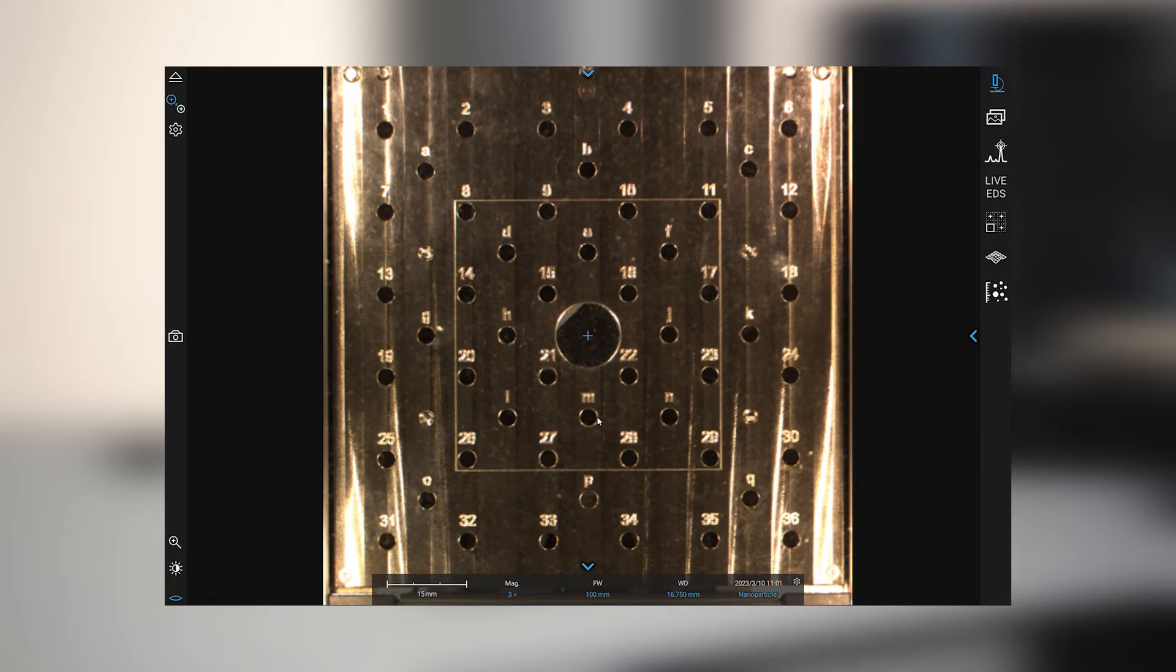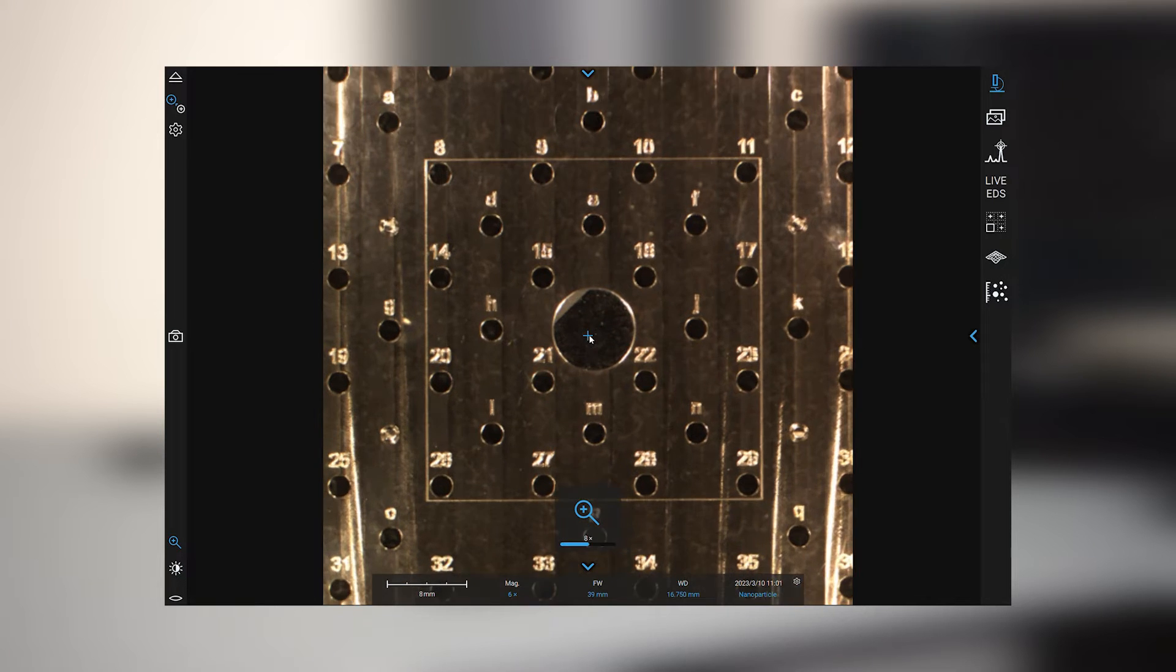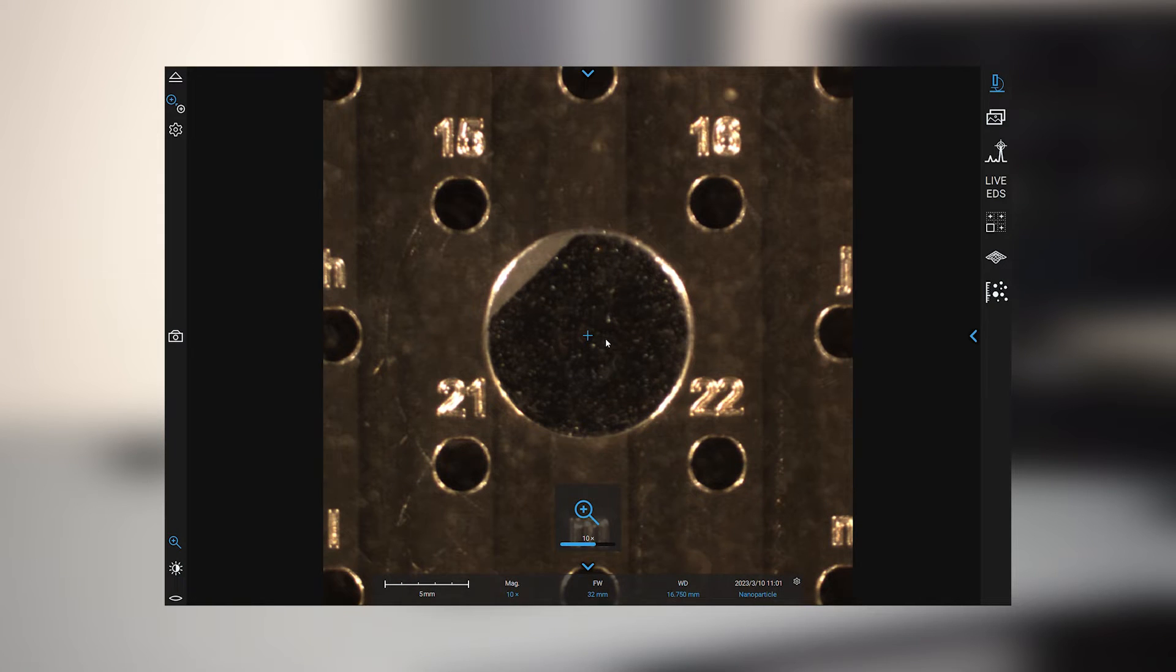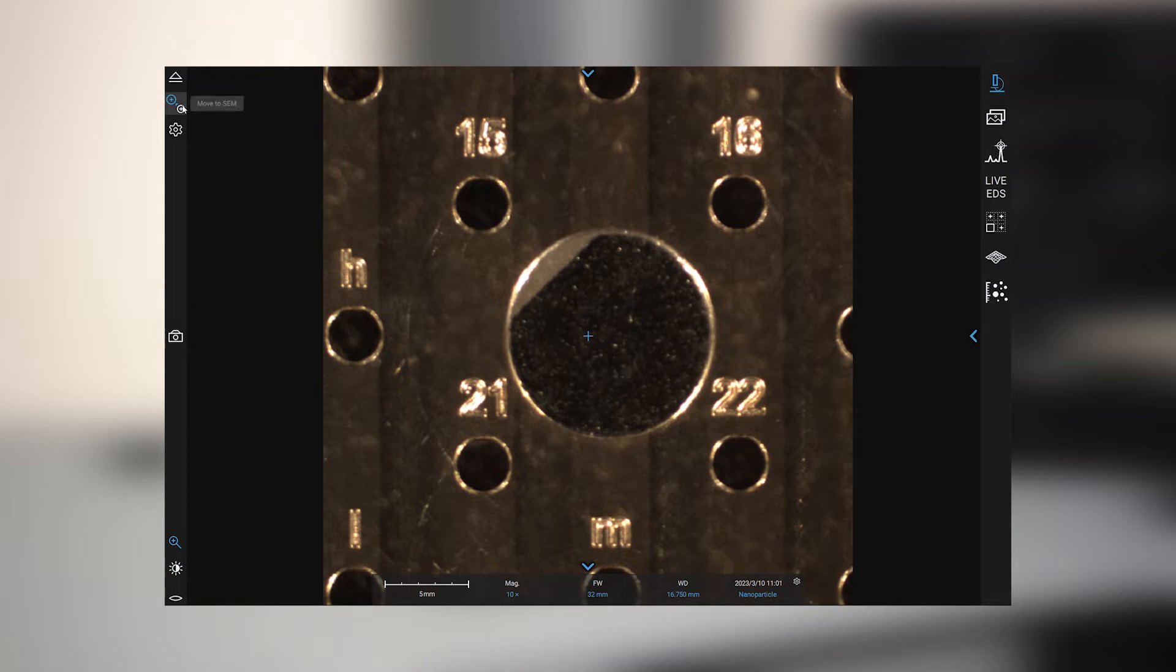So immediately on the screen I'll have an optical navigation camera in which I can pick an area of interest that I want to analyze and simply click move to SEM.